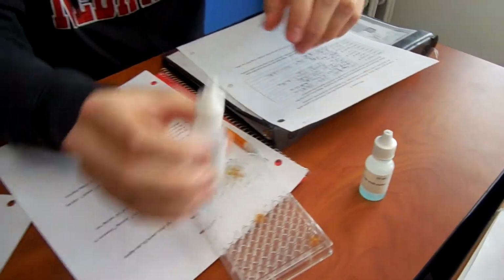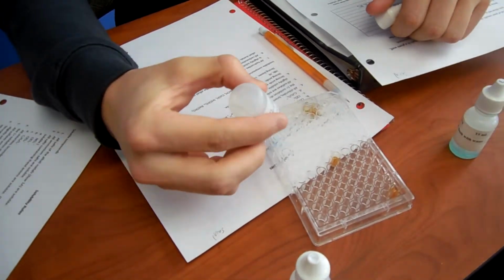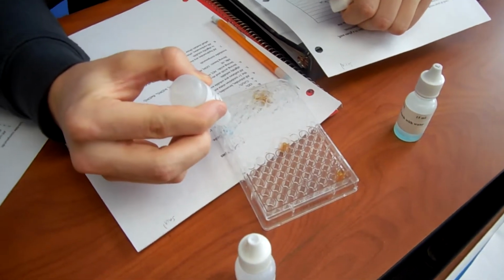I'm surprised. All right, so Saul's going to mix copper nitrate and sodium hydroxide. There's copper nitrate. So don't use these two wells, because when that bottle opened, it splashed. So just pick one far away from the splashing, straight up and down. Okay, so we've got copper nitrate. We've got sodium hydroxide. We think we'll get a precipitate.